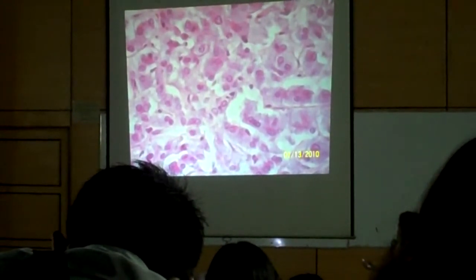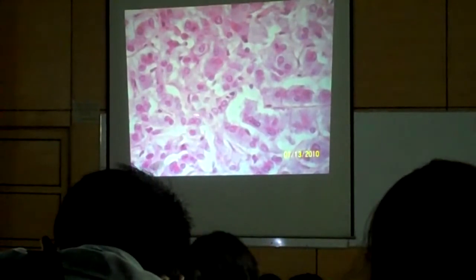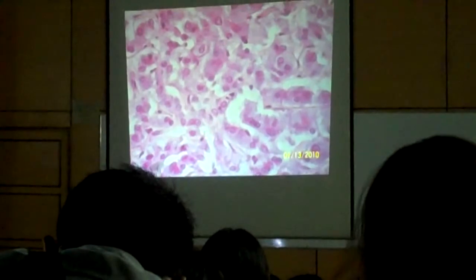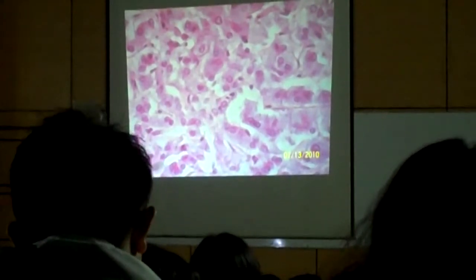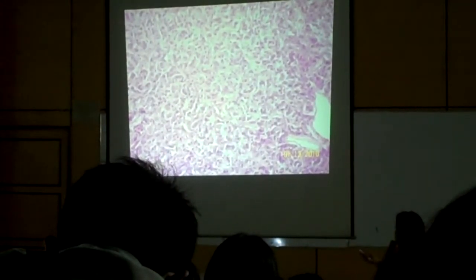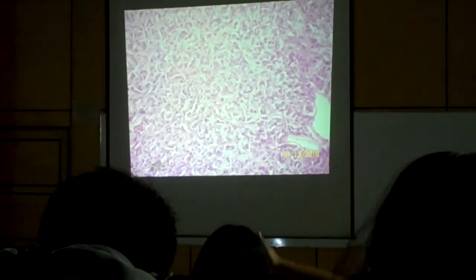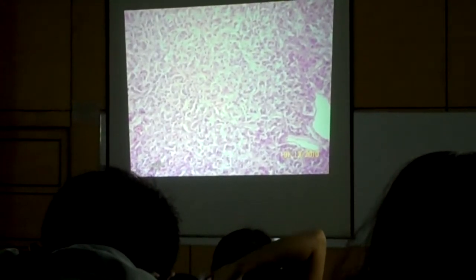So you have bridging of the cells. So it looks messy, like. Okay, and this is the medulla. Okay, again, if that's all you see, can you be able to identify that layer?